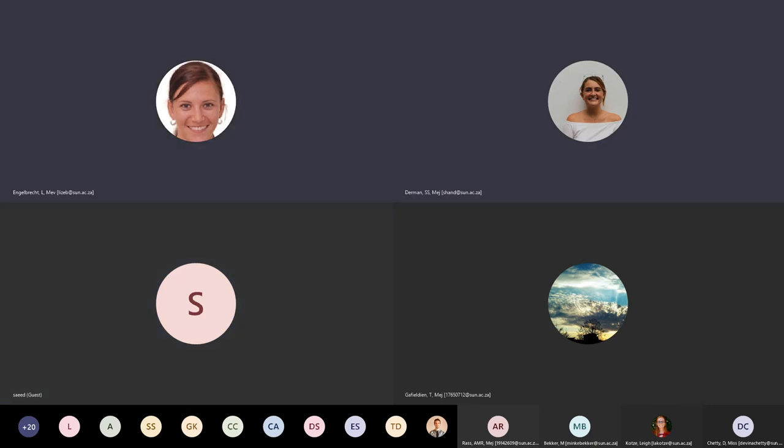Okay, that is strange. I know there is some information that doesn't automatically go to ImageJ. You have to do a scaling step in ImageJ itself, but the raw data will have your scaling information, which you can then manually input into ImageJ. But why it doesn't take the scale bar over, I don't know, to be honest. I think it's a feature of ImageJ where it takes more the raw data. Each JPEG also has information.